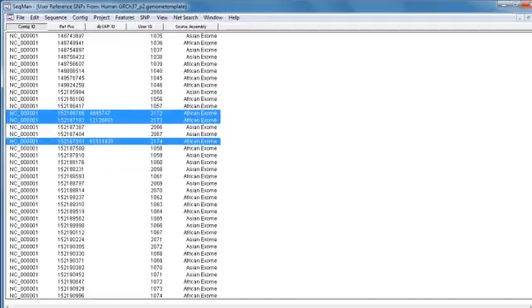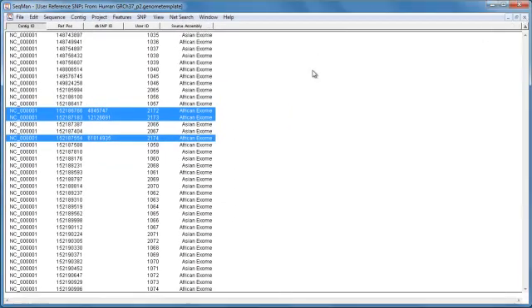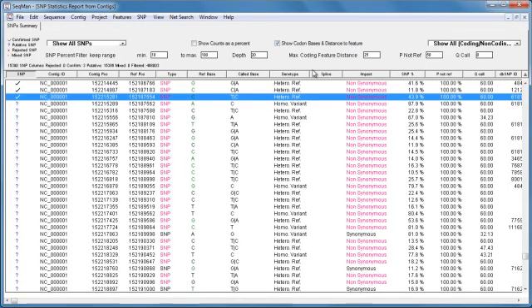I can save these SNPs by closing the report and then saving when prompted. And this is going to add these SNPs to the template package. So if I use the same template package in a future assembly, those SNPs will already be annotated.